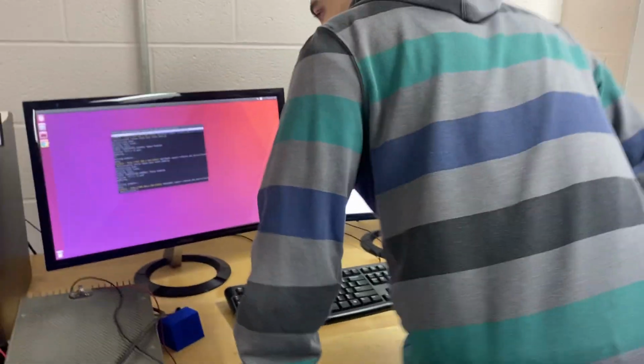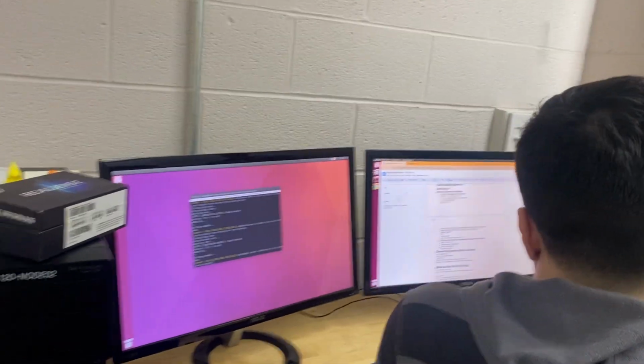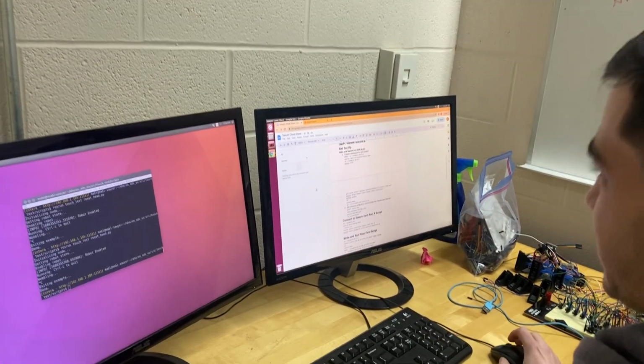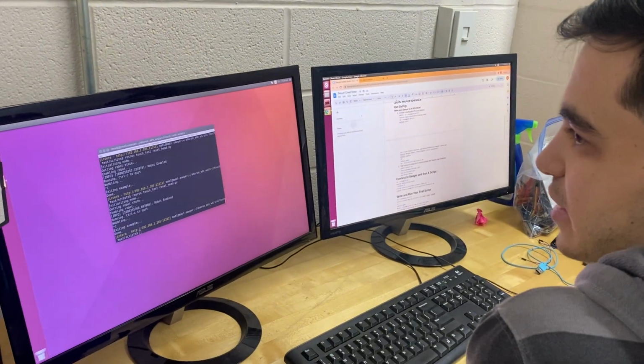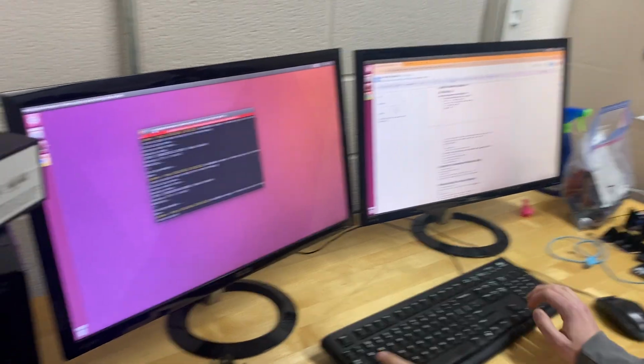In the meantime, I guess we will run through getting your workspace set up and everything. So SDK mode. Let's do any one of these.